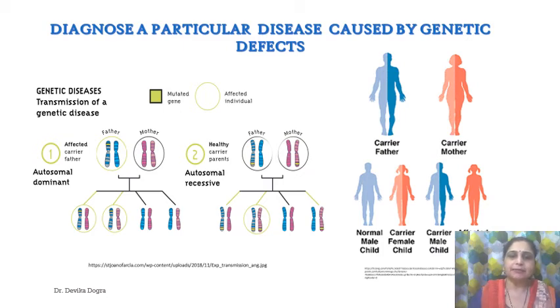In sickle cell anemia, for example, the exact nucleotide change in the mutant gene is known. The sequence GAG is changed to GTG at a specific point in the DNA strand, and that codes for the beta chain of hemoglobin. For the prenatal diagnosis, the two DNA oligonucleotides are synthesized, one corresponding to the normal gene sequence in the region of the mutation and the other corresponding to the mutant sequence.